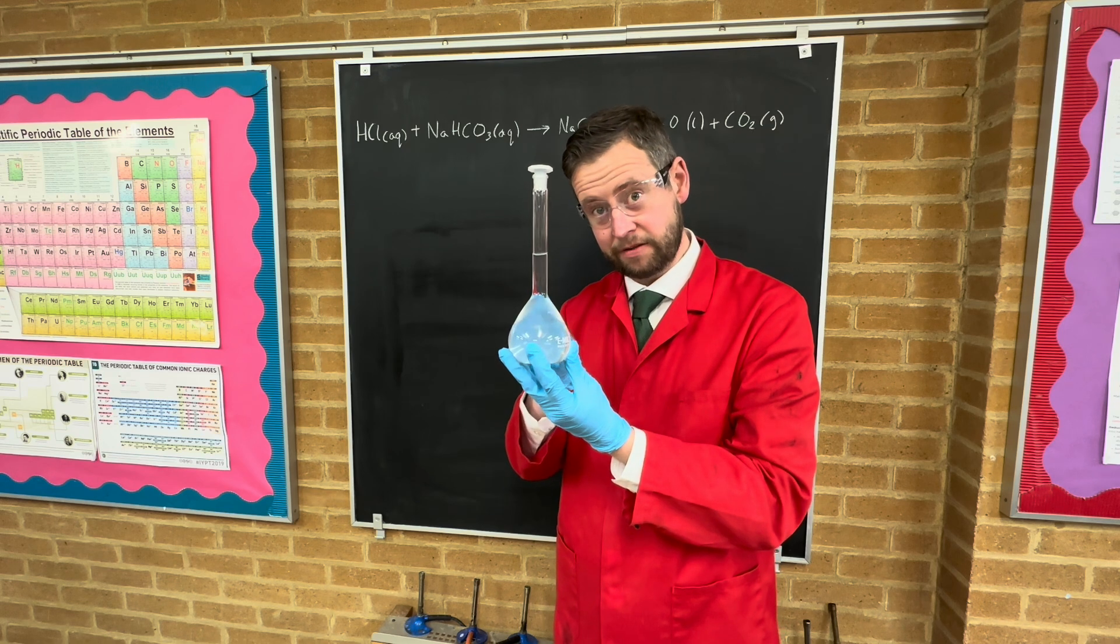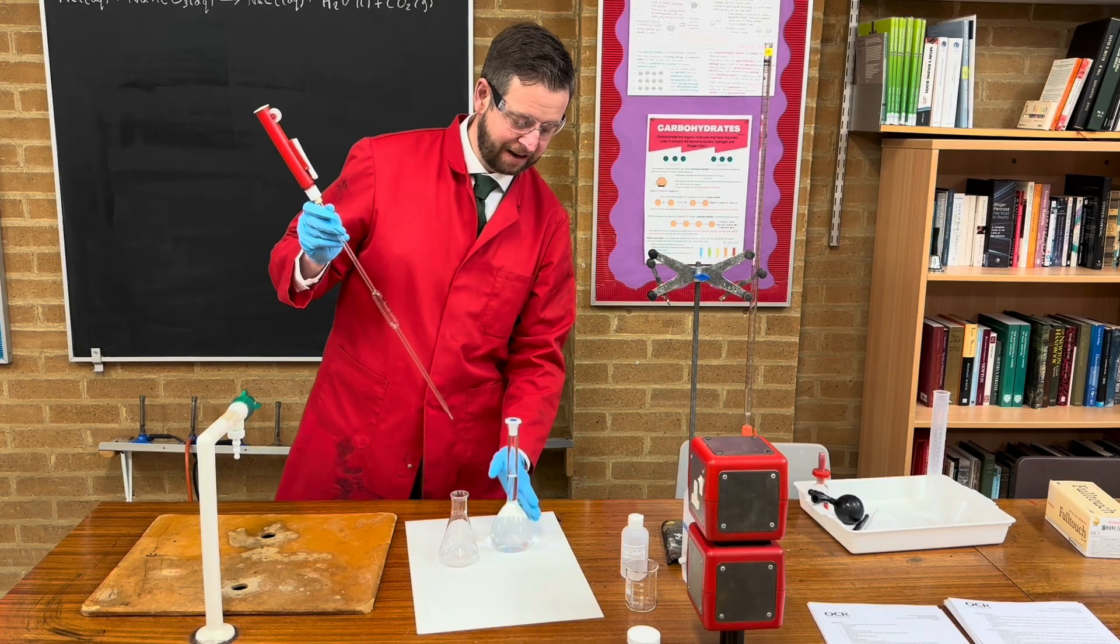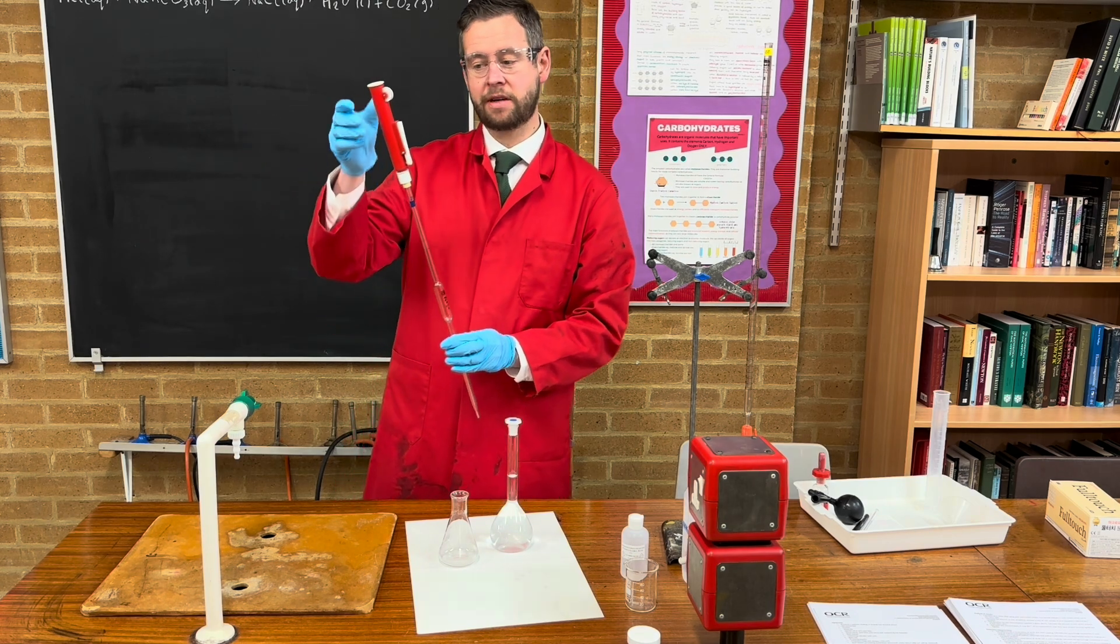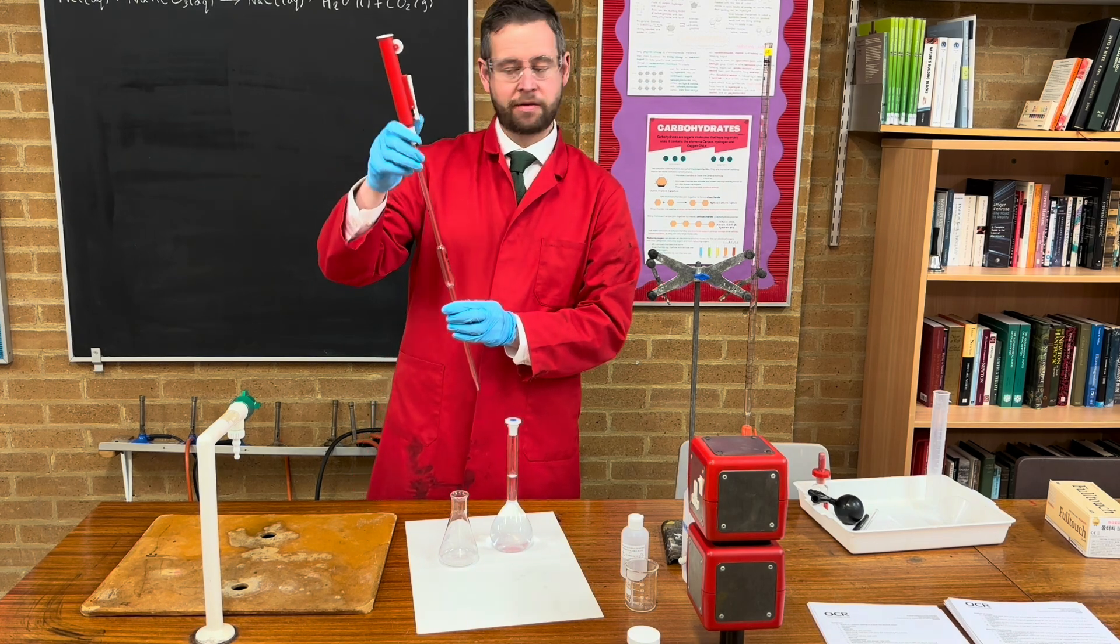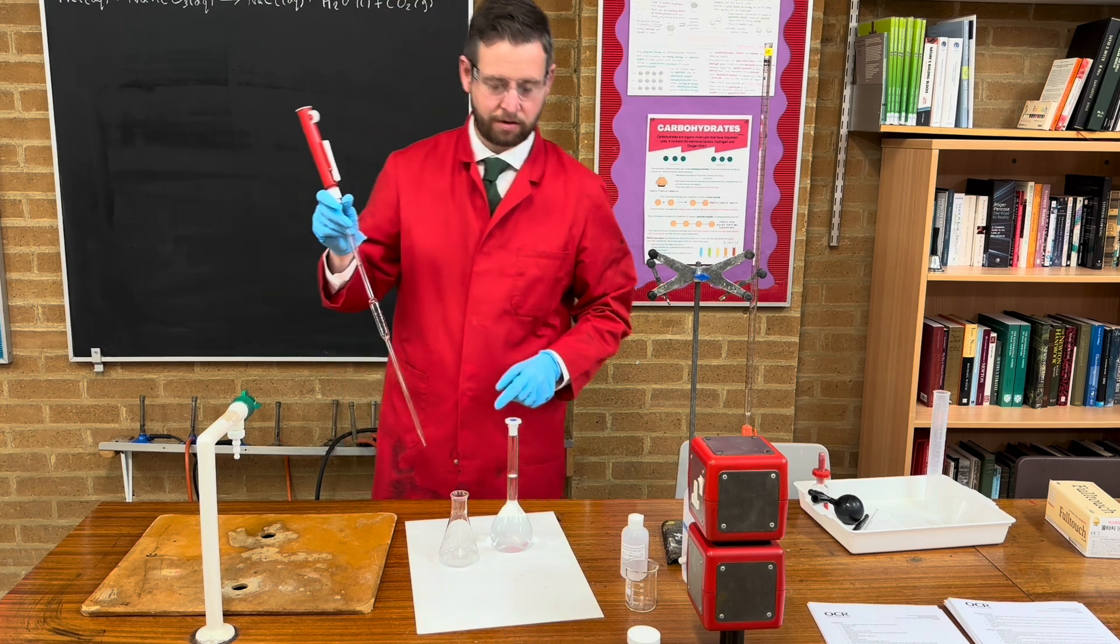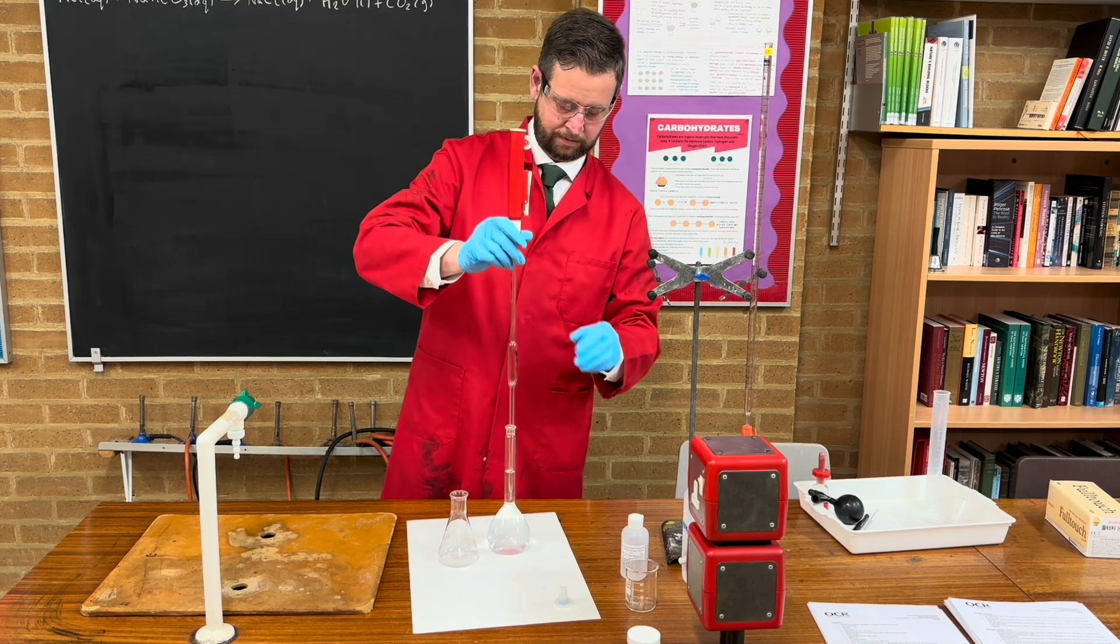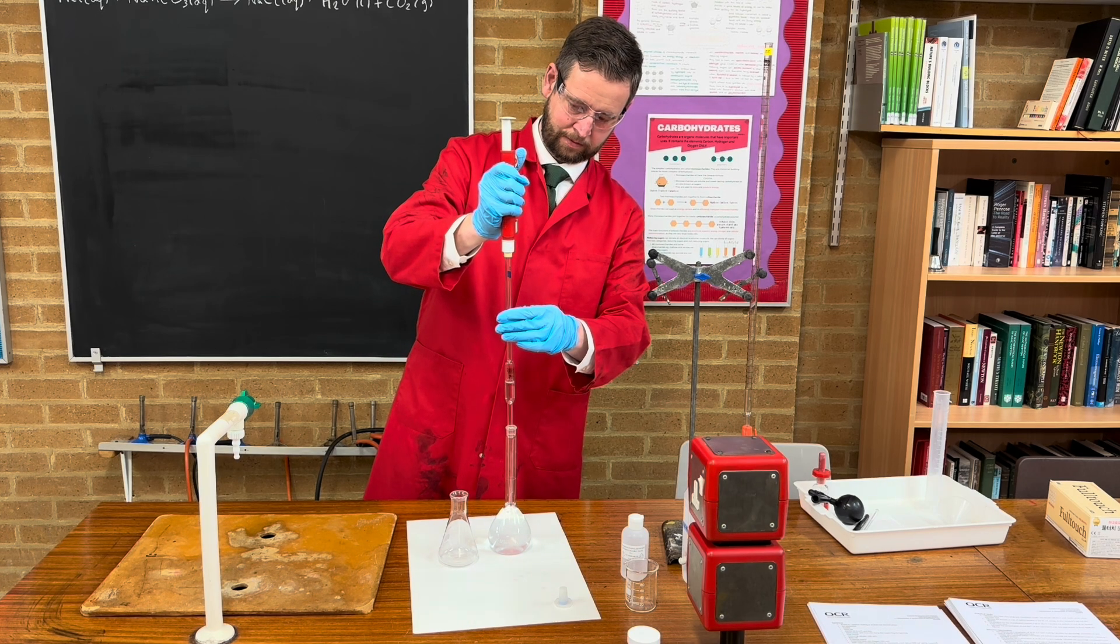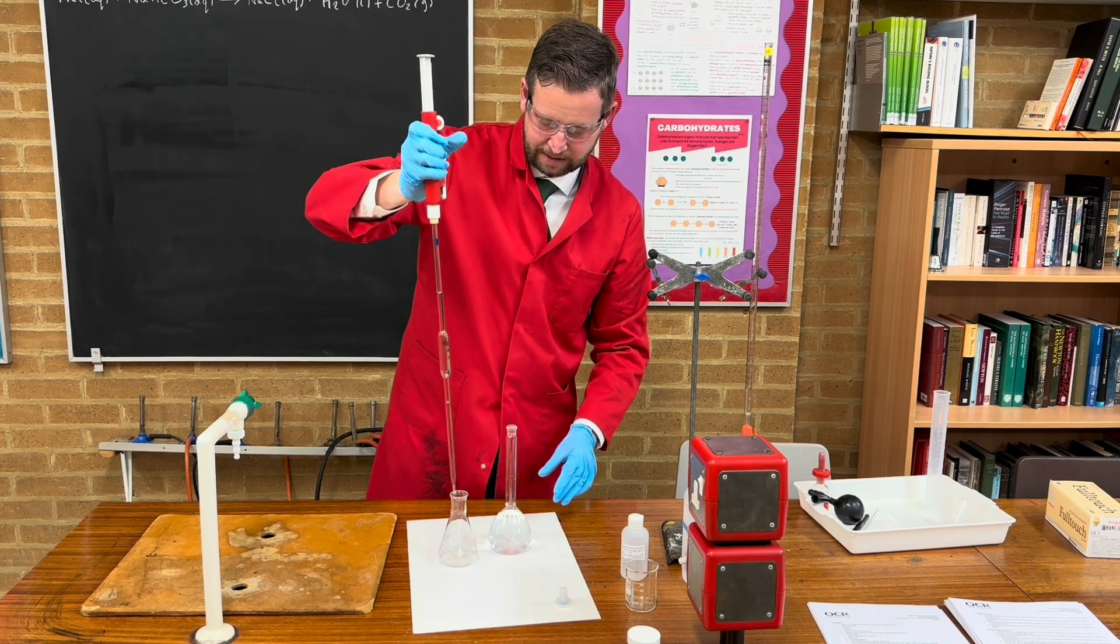We're going to take 25 milliliters of this, put it in the conical flask at the bottom. This is going to be the analyte. So I'm now going to take 25 milliliters out of our standard using a 25 milliliter pipette. This way is quite simple because it allows you to wind it up and then press the button for release. Fill it all the way up to the marker, bottom of the meniscus relative to this, and then put it into the conical flask. Excellent, 25 milliliters exactly. In it goes.